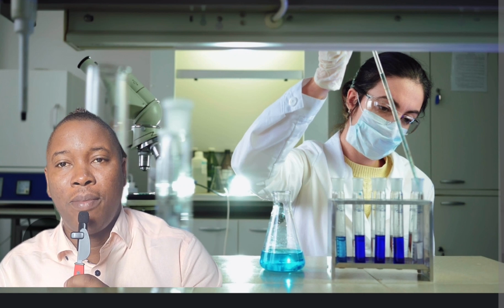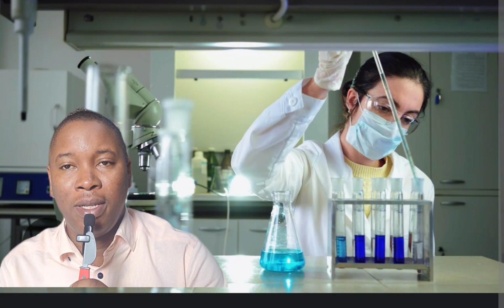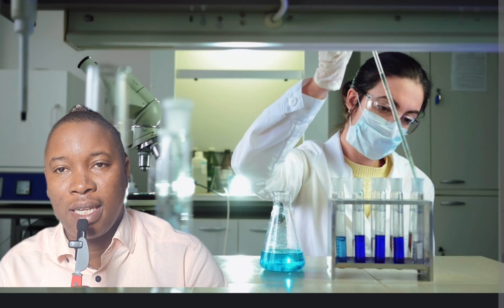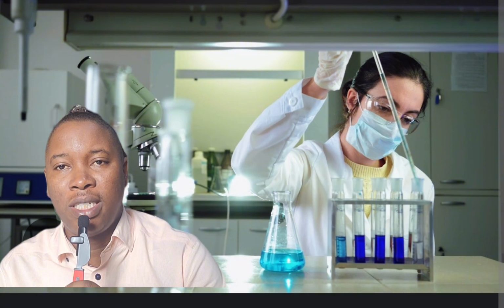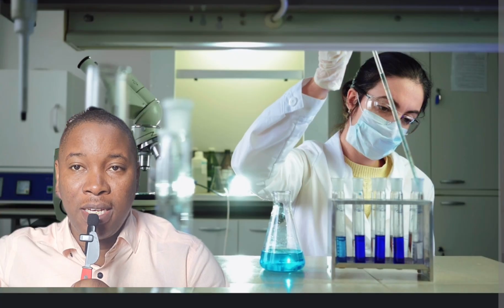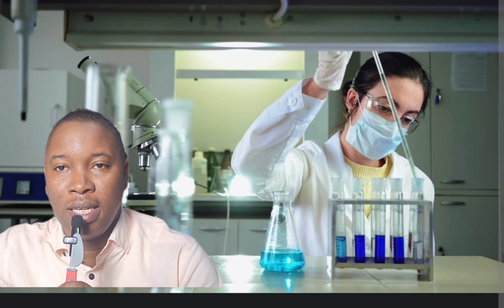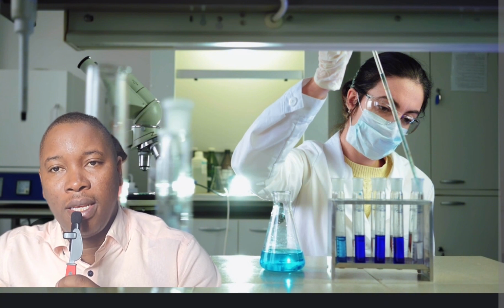Many times there's a family that we call the Enterobacteriaceae. This family has Escherichia coli, Shigella, Salmonella, and Klebsiella as part of it. Many times we need to differentiate the different members of this family from one another, and a very good set of tests to use is the IMViC battery of tests: Indole, methyl red, Voges-Proskauer, and citrate test. Now we'll talk about the Indole test.